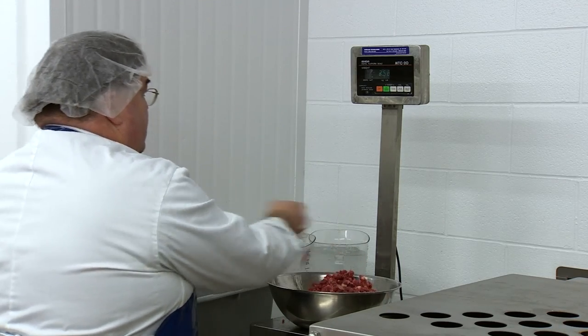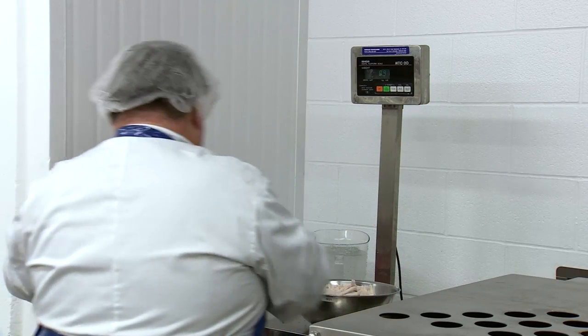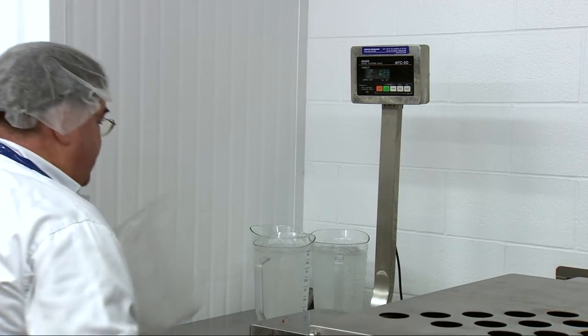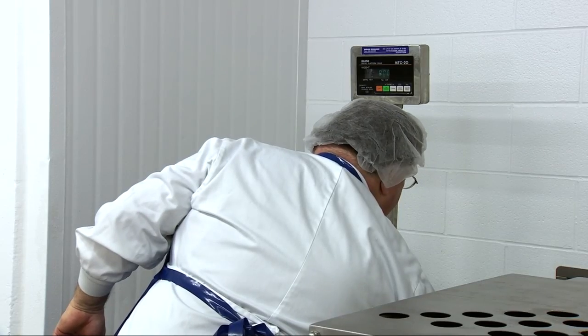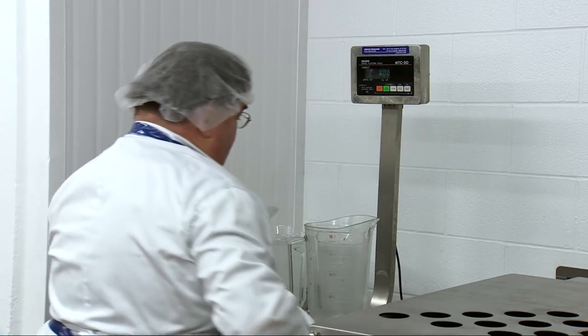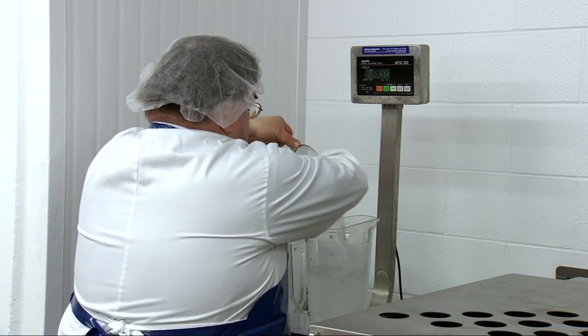Once all the meats are ground, they will be weighed according to the recipe being used. Ice water will also be used in the recipe, both to add moisture to the hot dogs for that juicy taste, but also to maintain a low temperature during the initial stages of chopping of the sausage mixture.